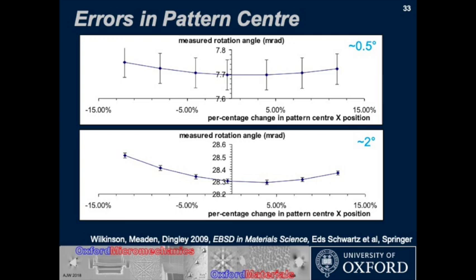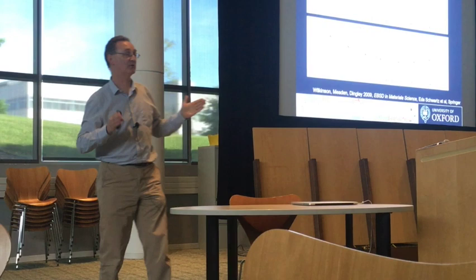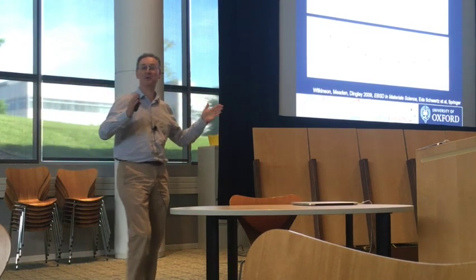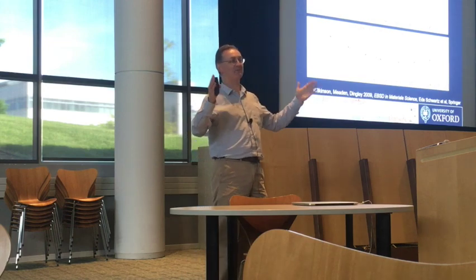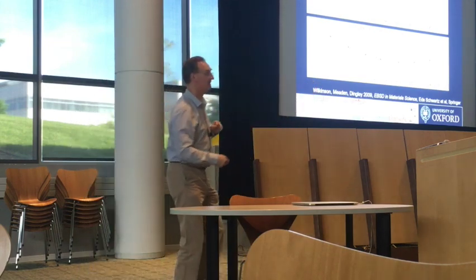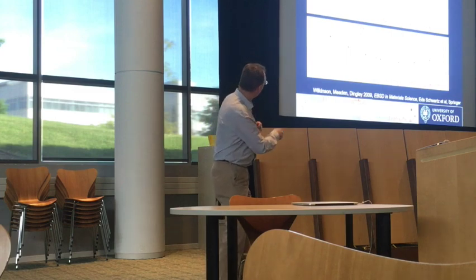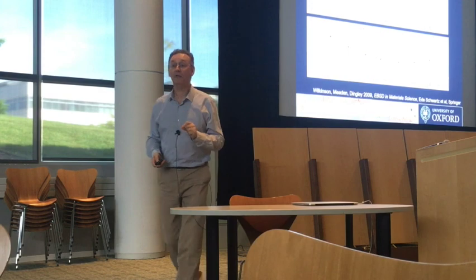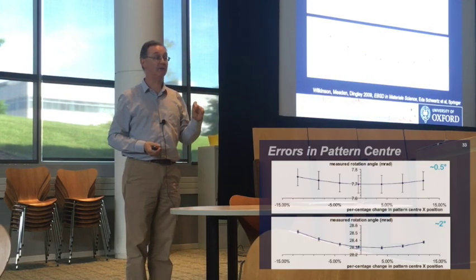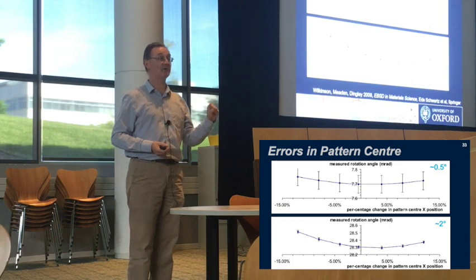So that would be a horrendous calibration. It's the sort of thing that would make Joe or Mark DeGraff, who talked about calibration earlier on, absolutely furious if you did that. You really do need to do better than that. But actually, the accuracy in our measurements is not so sensitive to that, as long as all the patterns are taken in the same geometry.